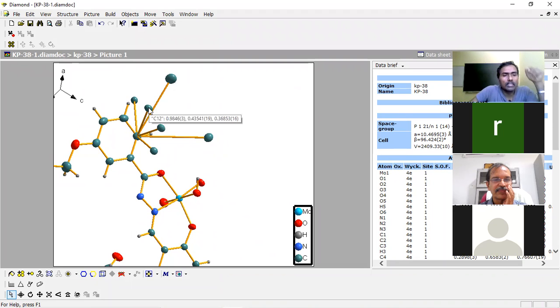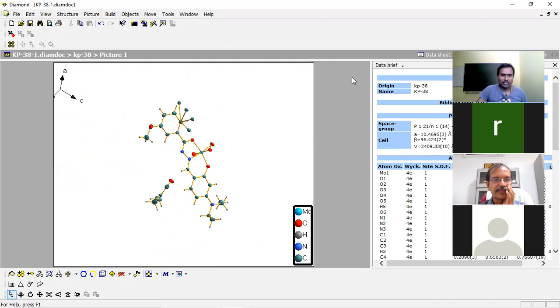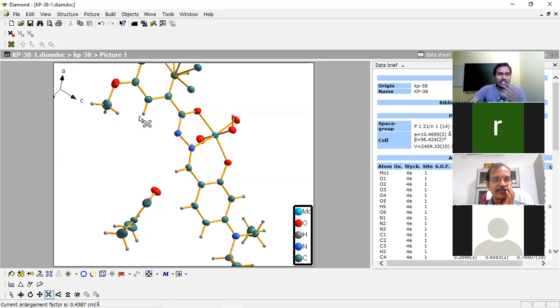So look at this. This is C12. C12 belongs to CG4. C11 and C10 belong to CG4. So therefore we can delete the others. These are not needed at all. And what about this? This also we can check again. C14, that is in the CG4 ring. So we can leave it.